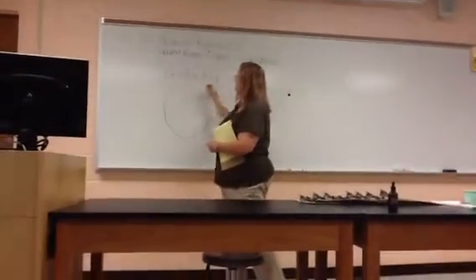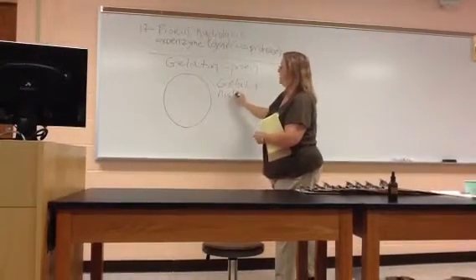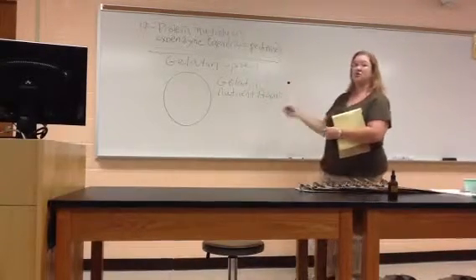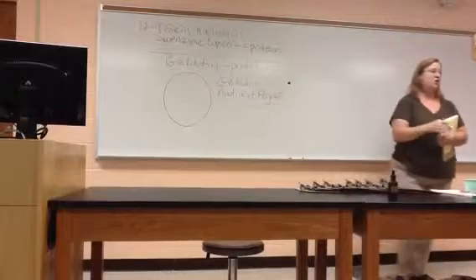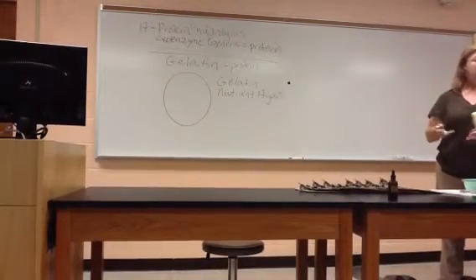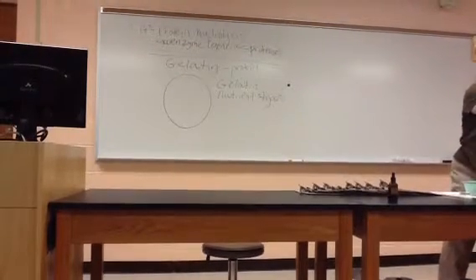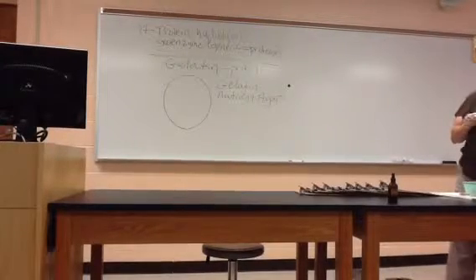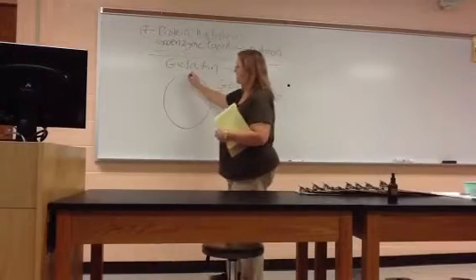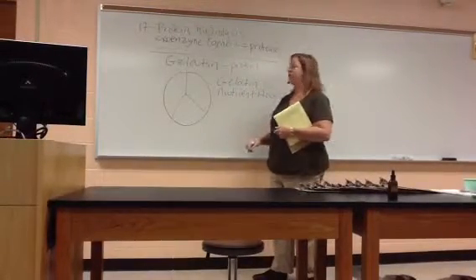Petri dish again. The agar is gelatin nutrient agar. Remember, I'm a stickler for the names on quizzes. I want spirit blue lipid agar for the lipase test, gelatin nutrient agar, all three words for this test. Basically, we just mixed some of that powdered gelatin in with the nutrient agar when we made it. And that's your first Petri dish here, well, my right, your left, I guess. The gelatin nutrient agar. You're going to do the same thing that you did last time, divide it up into 3 sections, with your pen, marking it on the back on the agar side.